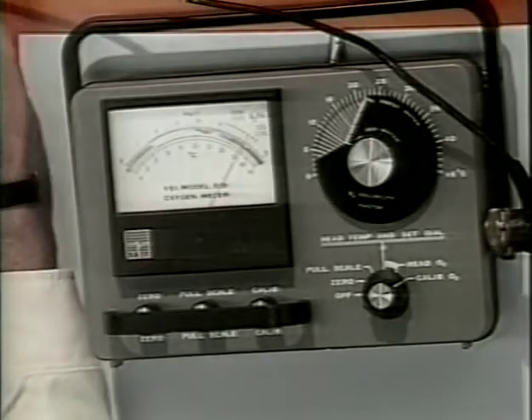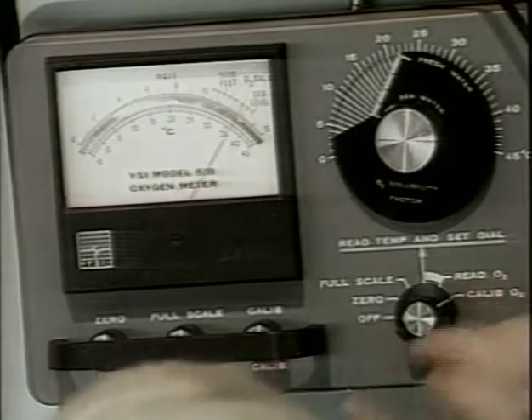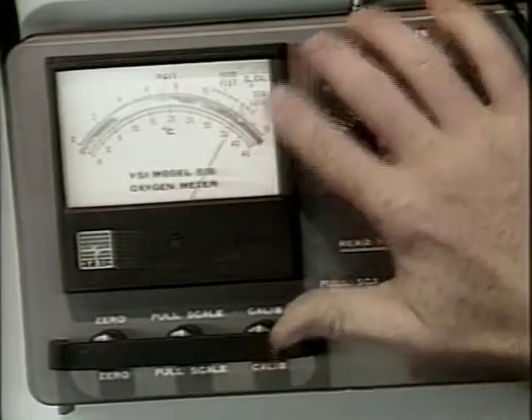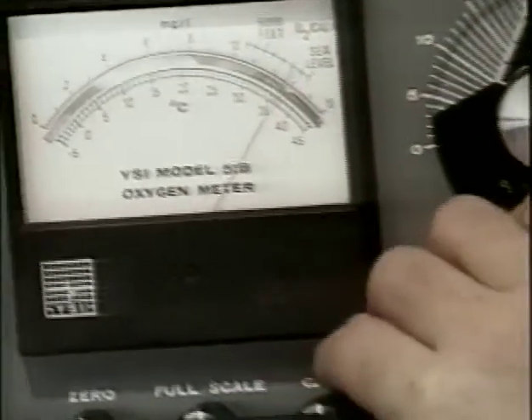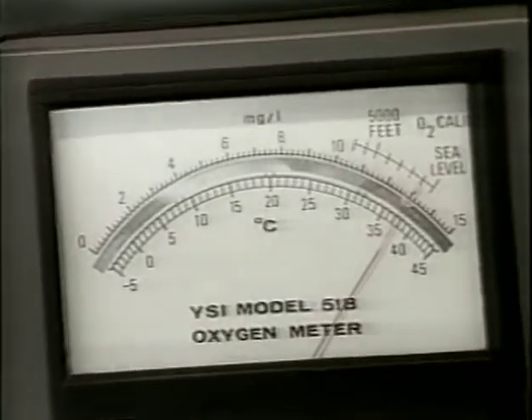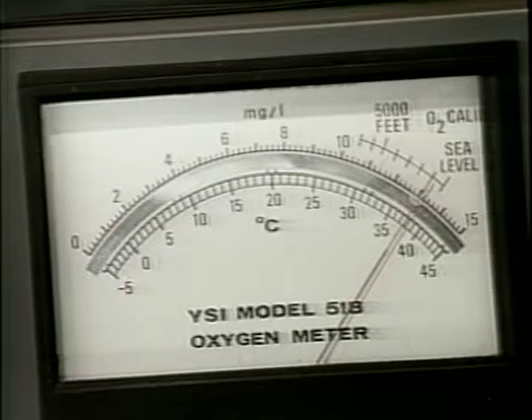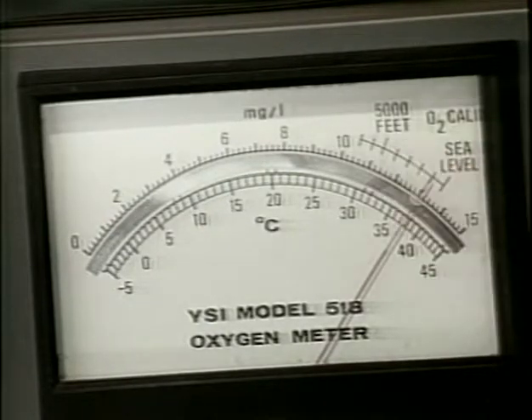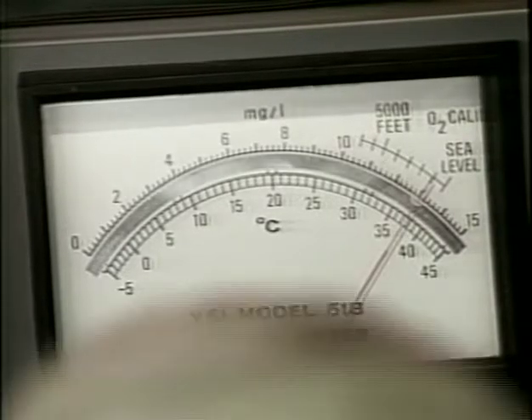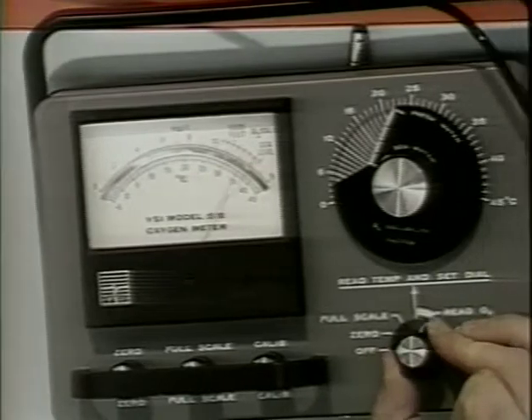At this point, the operation of each meter will be discussed separately. If your meter has a calibration scale located above the oxygen and temperature scales, switch the meter to the calibration position and adjust the knob so that the needle indicates the local altitude in feet. Allow time for the needle to drift, then readjust until a stable reading is obtained.